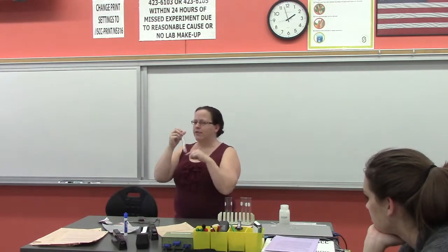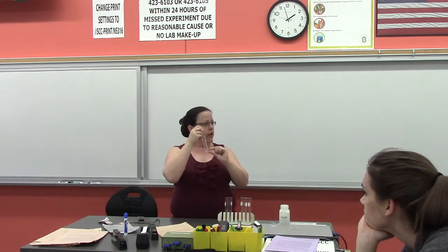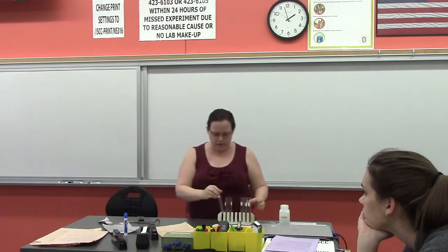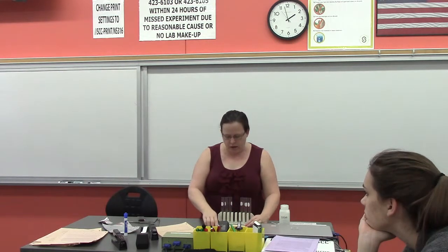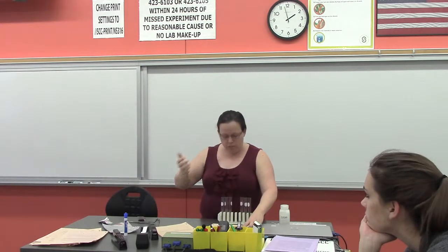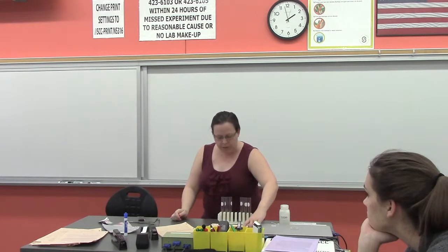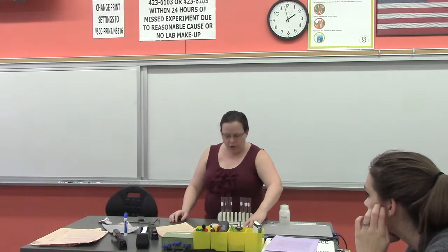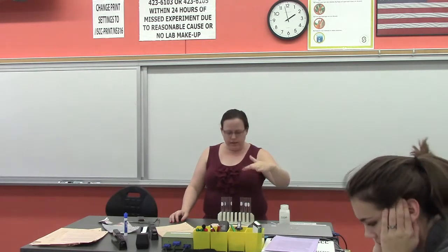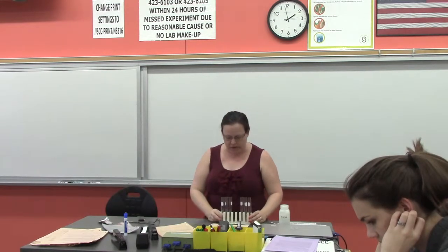And if you use different amounts, different volumes, you can tell, is the liquid in smaller volume the one on the bottom, or is the liquid in larger volume the one on the bottom? So that's why we're using those different amounts, okay? So then you're going to decide between water and ethanol, can you tell which is more dense? After you've done your complete experiment, you should be able to rank all 3 liquids in order of increasing density. So show most, middle, least, and then explain how you figured that out. So use your test results to help you figure that out.